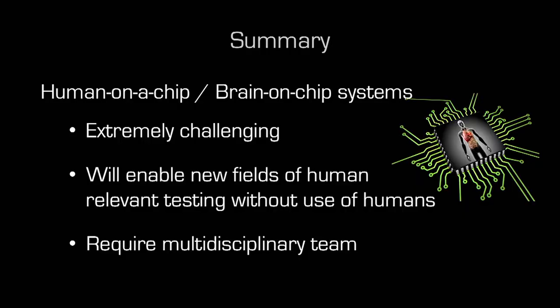And this is pretty important because it's really challenging to try to recreate biology on a chip. And by using a method that allows the cells to do a little bit of the job themselves makes it easier on us. And Chris mentioned before that the reason that we're doing all of this is because we want to be able to develop maybe better medicines, detect better toxins, but also we're interested in the science itself. Because it's really hard to understand human physiology when it's locked up inside of us, right?